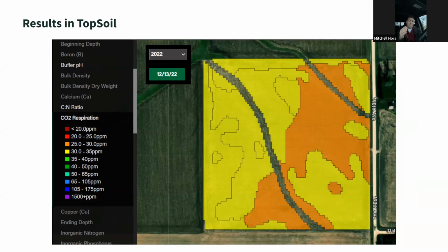But as you're thinking about where to pull these samples from, keep in mind that it'll be a view like what Carolyn has, except it'll be a little bit more square, like she's saying, east versus west, because the east is all cover crop. The west has been no cover crop, or on the west side is the fence row. The east side is out in the field, so it'll be a side-by-side comparison. And then as we toggle through, you'll be able to compare the 2 samples together, but also compare the samples to the rest of our data set.